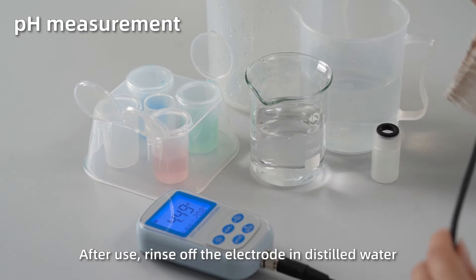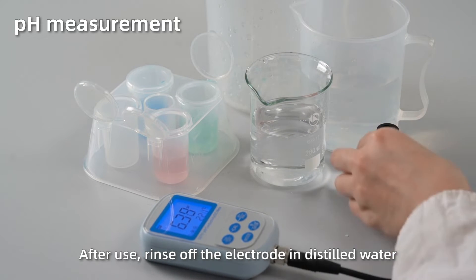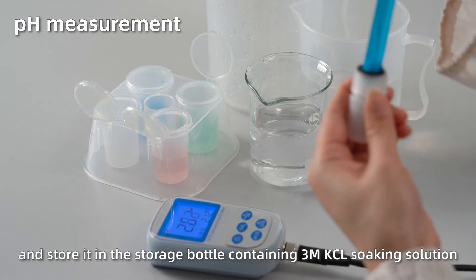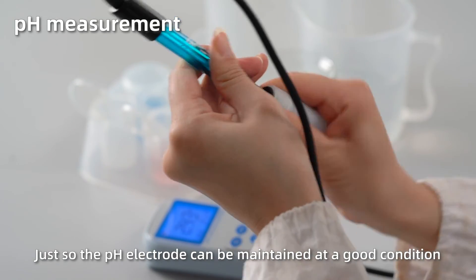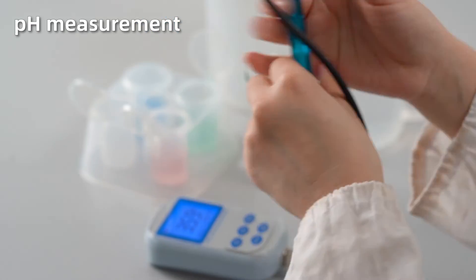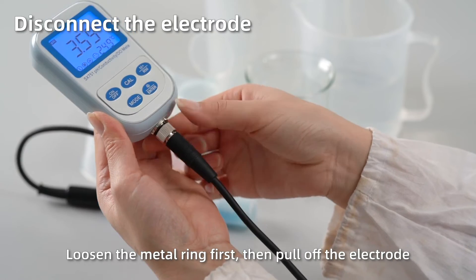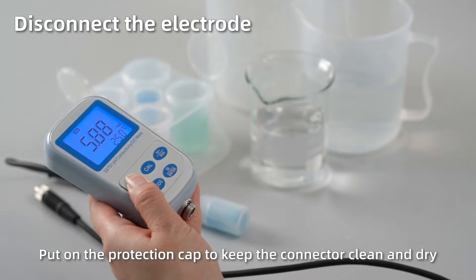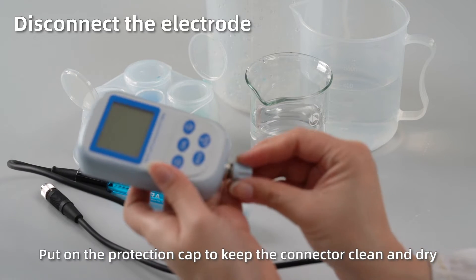After use, rinse off the electrode in distilled water and place it in the storage bottle containing 3M KCl soaking solution, so the pH sensor can be maintained at a good condition. Disconnect the electrode: loosen the metal ring first, then pull off the electrode. Short press off button to power off. Close on the protection cap to keep the connector clean and dry.